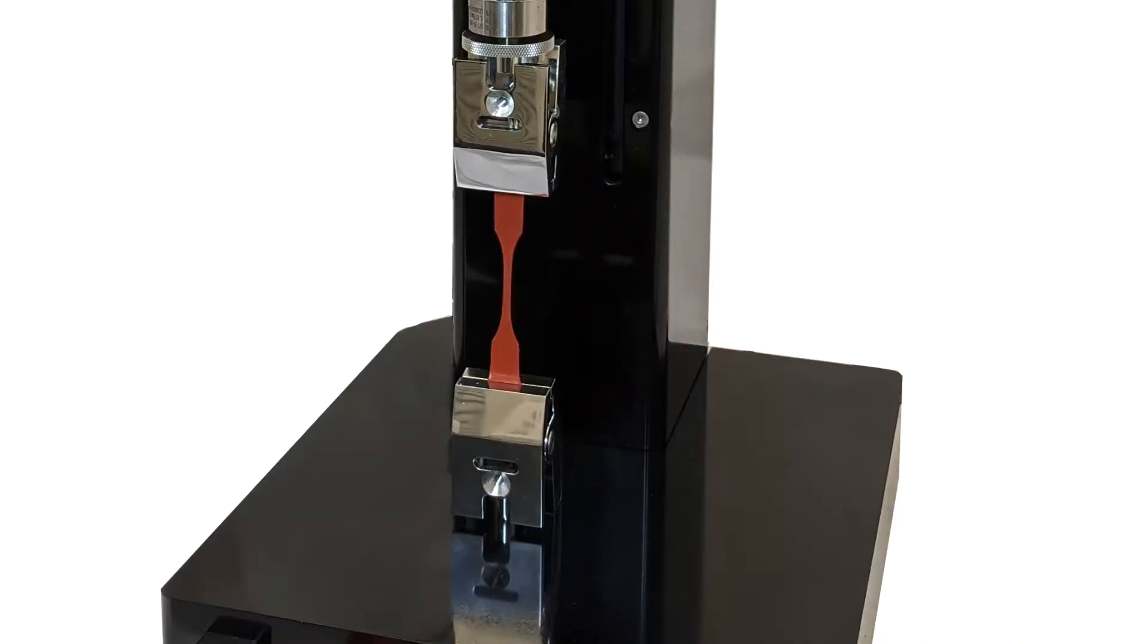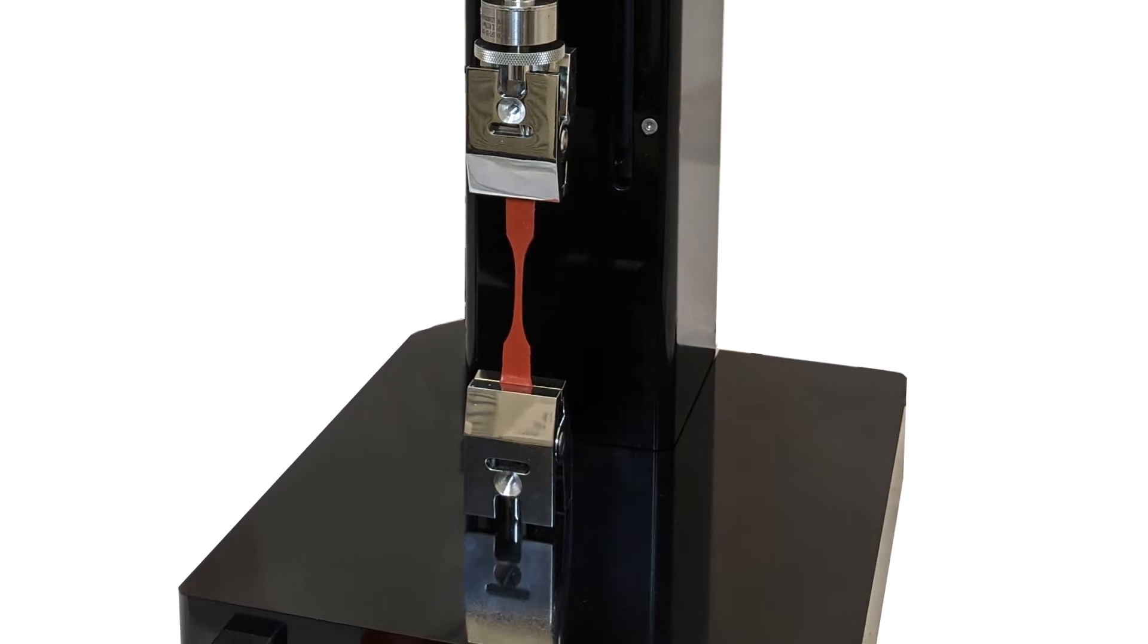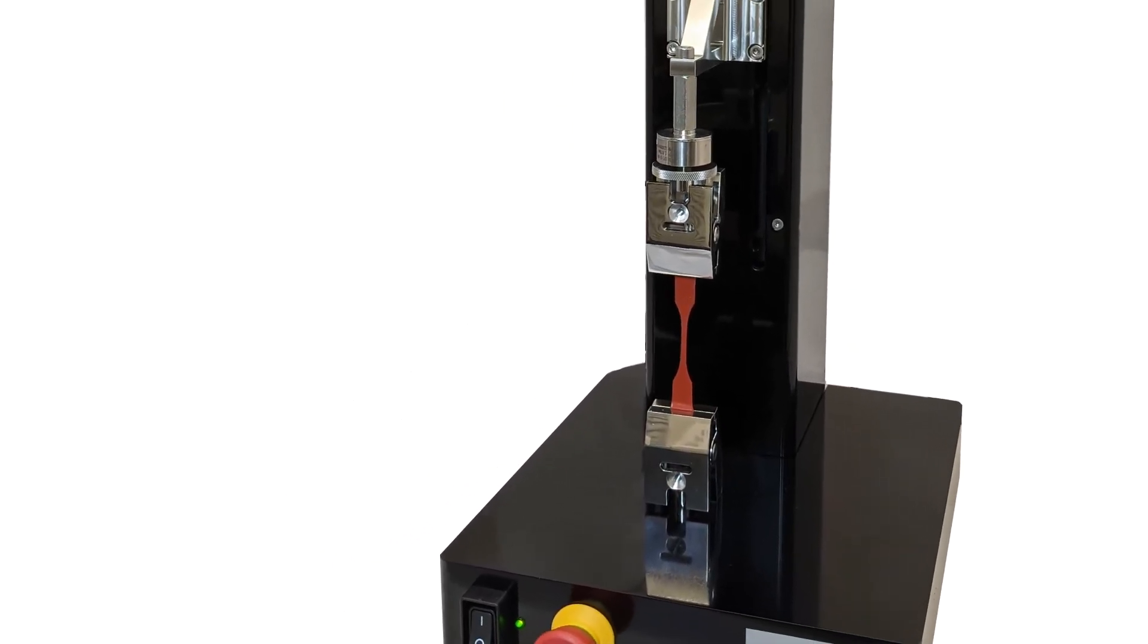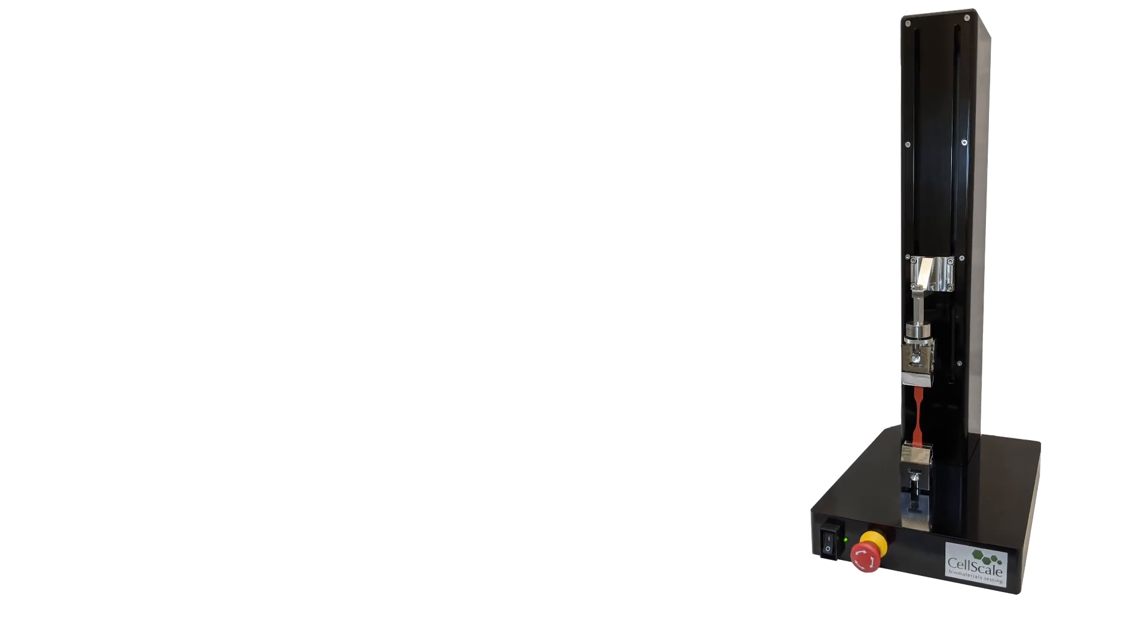Lower end of the specimen, we have a similar grip and these grips will be programmed to move either under force or displacement control to stretch the specimen and capture that force displacement data.